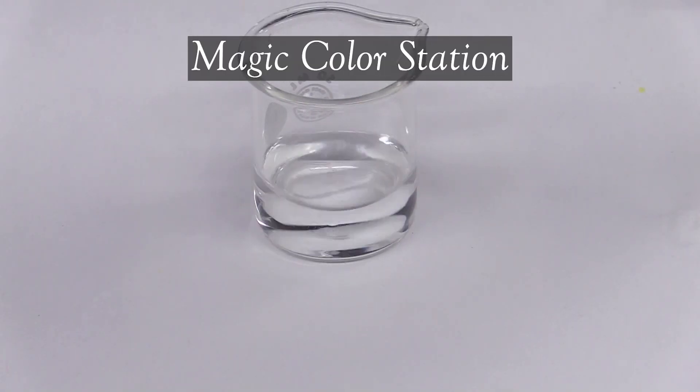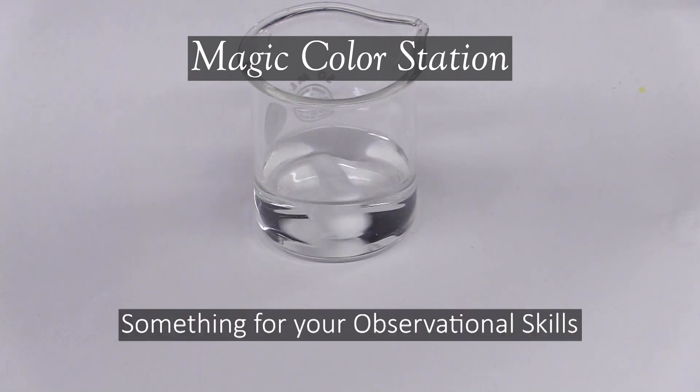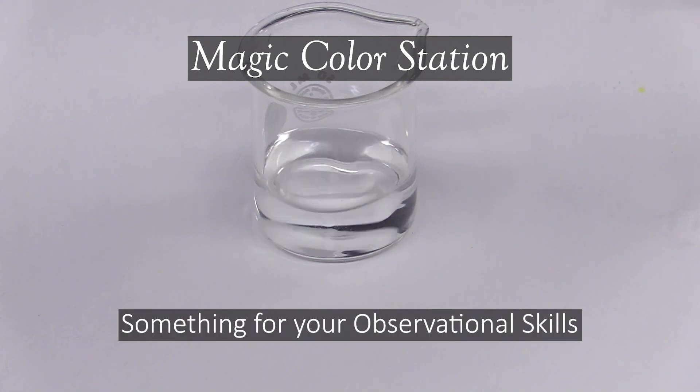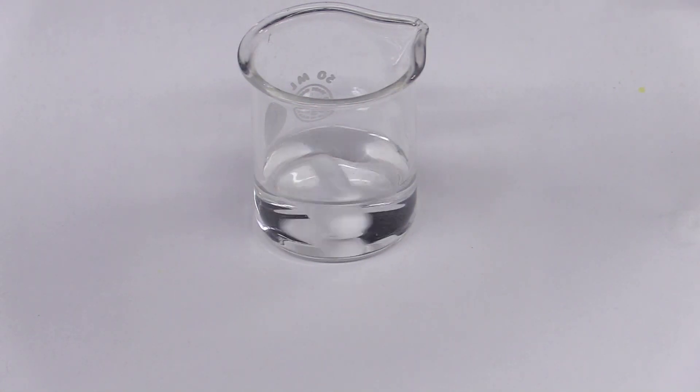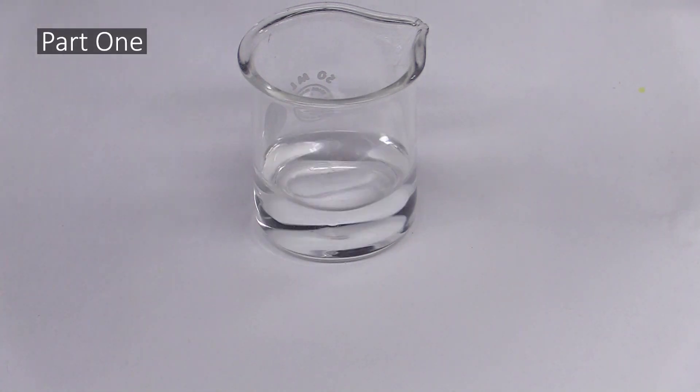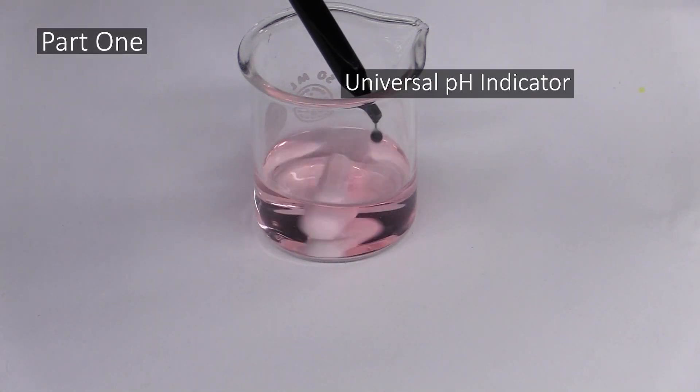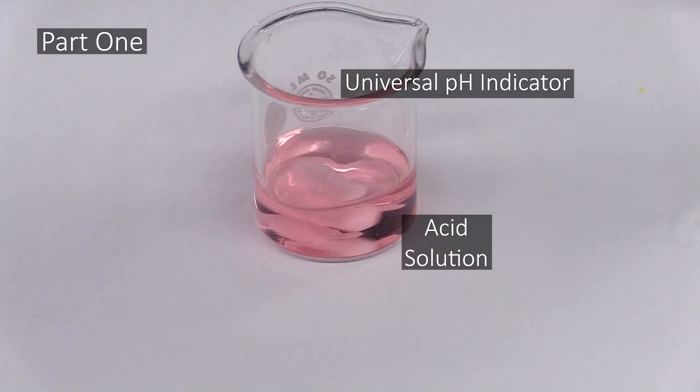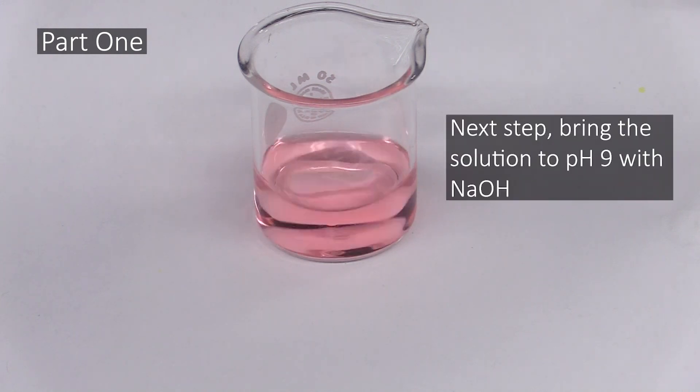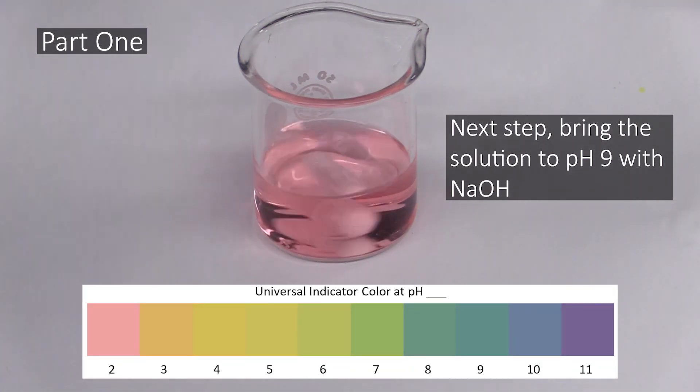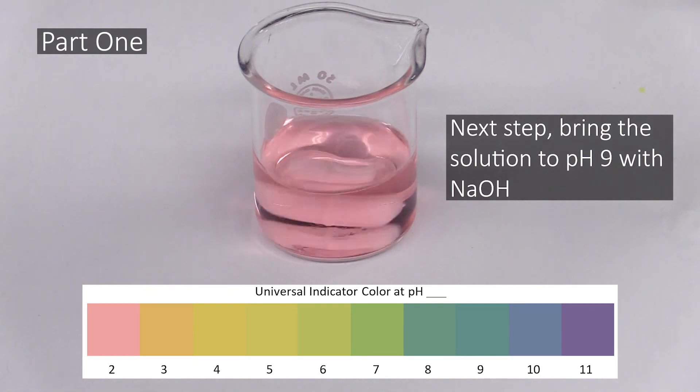Moving on to the magic color station. This one is somewhat unique in that there are no hypotheses to test here. It's mostly about honing your observational skills. This experiment will take place in two parts. In part one, you will first add a couple drops of universal indicator to a solution of acid. You'll then bring the solution's pH up to 9 by slowly adding sodium hydroxide solution to it. The indicator will tell you when you've reached the right pH by causing the solution to change to a certain color when it's at that pH.